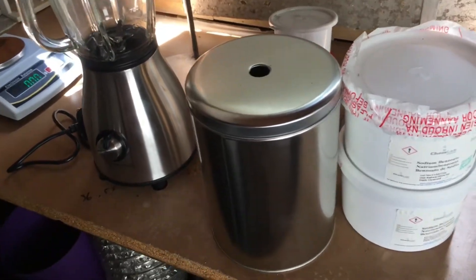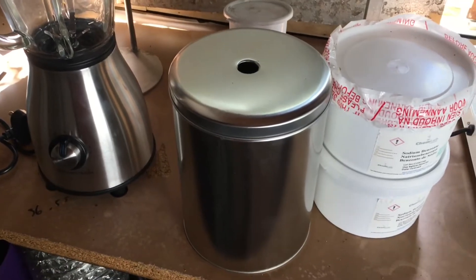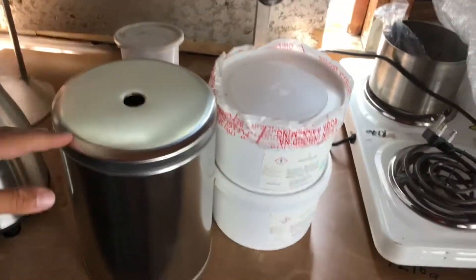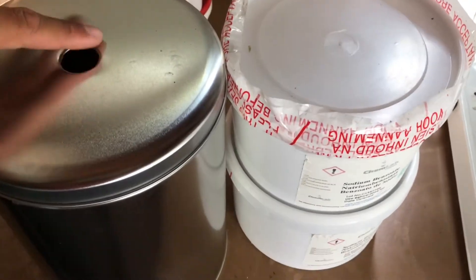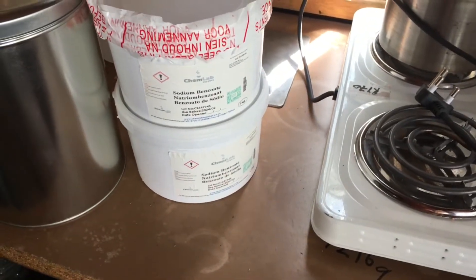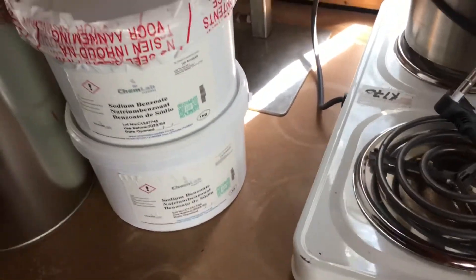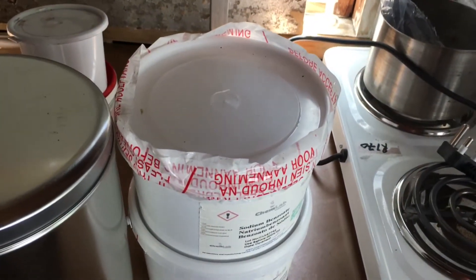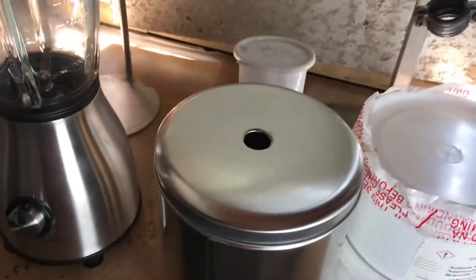Hello guys, in this video I'm going to be making some benzene. Benzene is going to be made from sodium benzoate and sodium hydroxide, heated in this can over here. As you can see I've made a hole in the top — I punched it. I'm going to be using quite a bit of sodium benzoate — 2 kg — and 720 grams of sodium hydroxide. The sodium hydroxide is in excess; it should be around 555 grams.